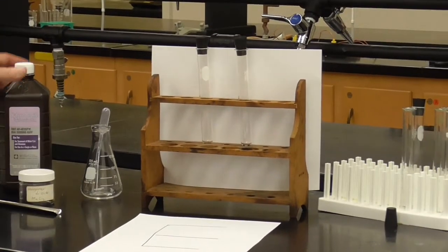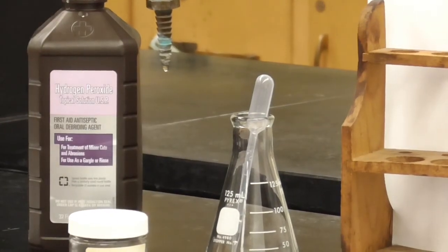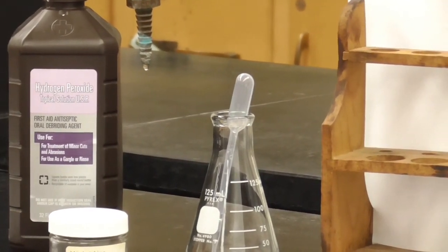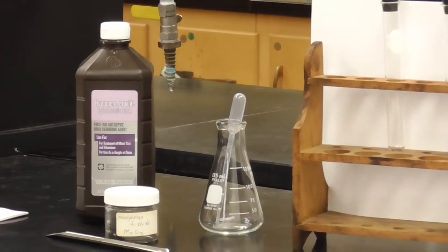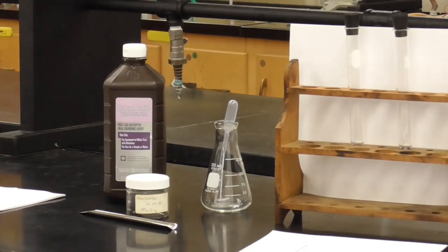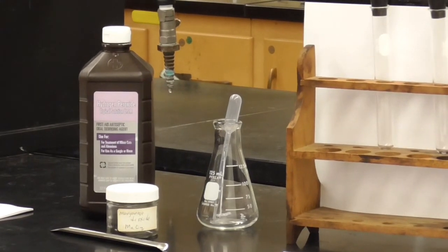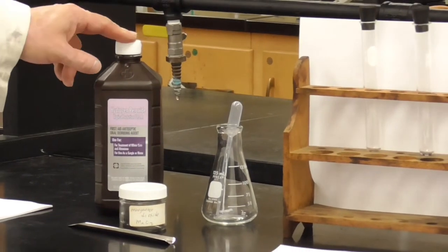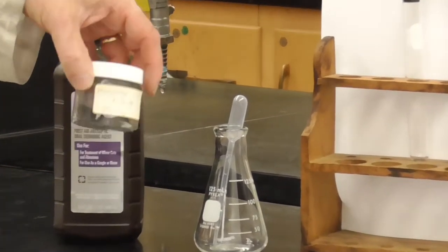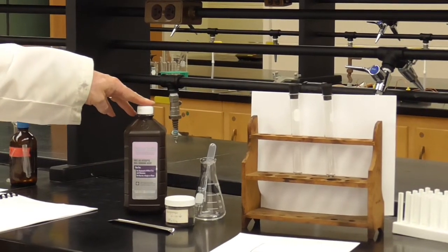You can buy that in any pharmacy store. And hydrogen peroxide does decompose, produces oxygen gas on its own. So if you've got hydrogen peroxide that's sitting around for several years, it's probably not what you think it is anymore. It's mostly water at that point because the oxygen will have escaped, and that's what hydrogen peroxide breaks out into, is oxygen gas and water. So you probably have just a jug of water at that point. All right, so this will decompose, but it's a slow reaction. Manganese dioxide, which is this black powder, is a catalyst for the reaction of hydrogen peroxide breaking down. So we're going to see the effect of it.